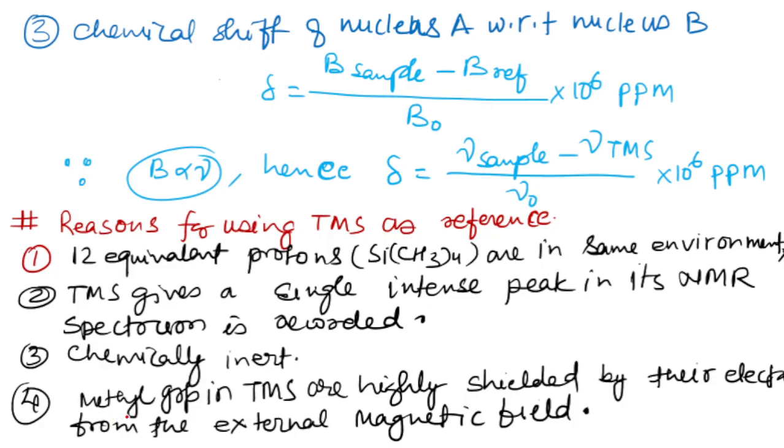The methyl groups in TMS are highly shielded by their electrons from the external magnetic field.